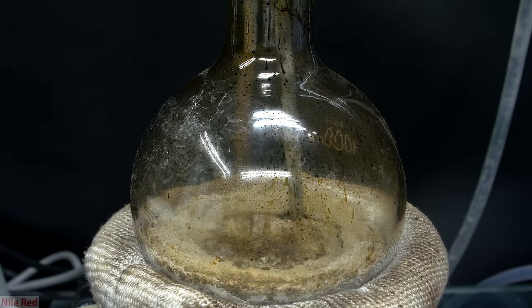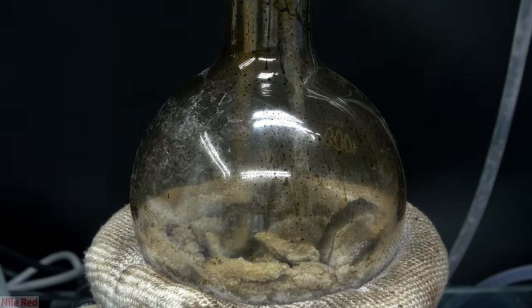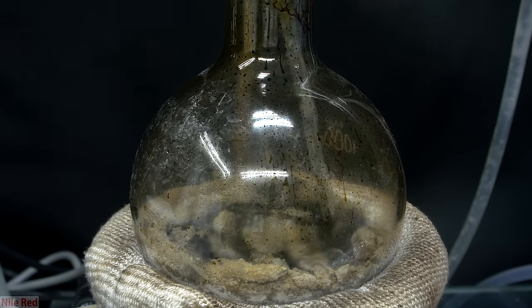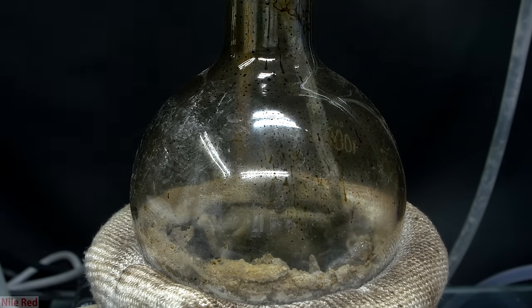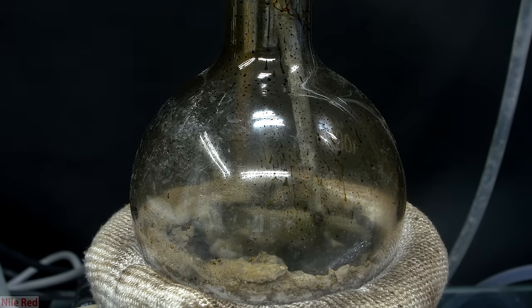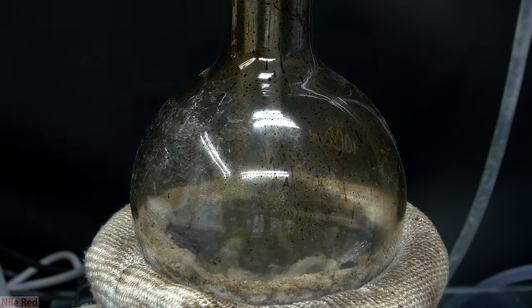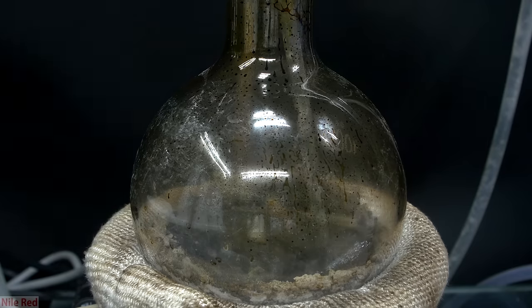After the distillation has finished and I've let everything cool, I start to poke around in the distillation flask, and you can see that we're left with a nice fluffy powder. In theory, if we used pure calcium acetate, we should be left with mostly just white calcium carbonate in the flask, but you can see here that that's clearly not the case. The calcium acetate that I used was the stuff I got from Tums, and I think there was a lot of organic material still left in it, and it just burned and made this carbon ash.